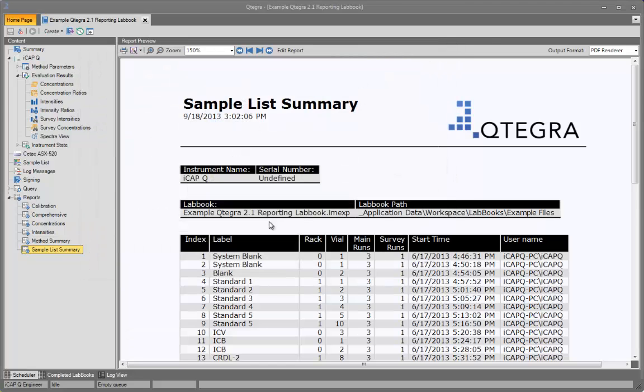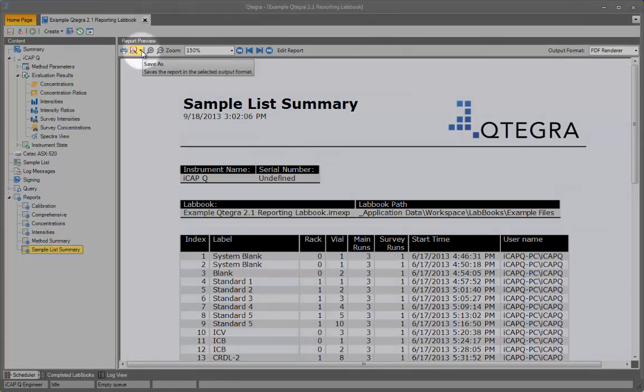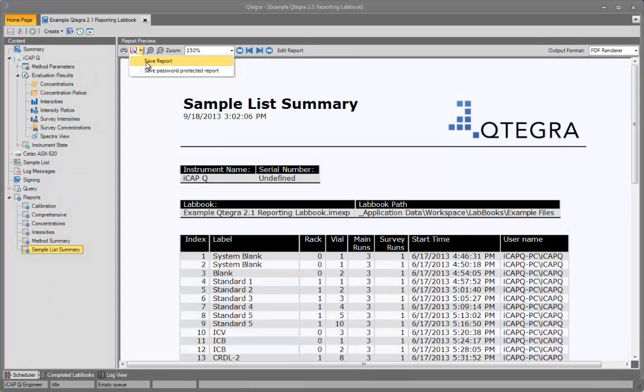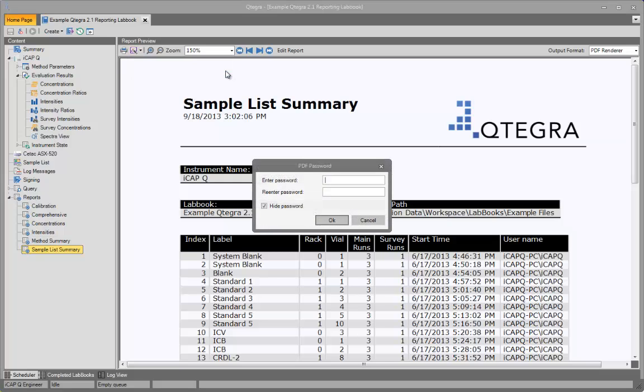If you click the alternate Save button, you can specify to save the report as a password-protected PDF file. Just enter your password using the dialog here.